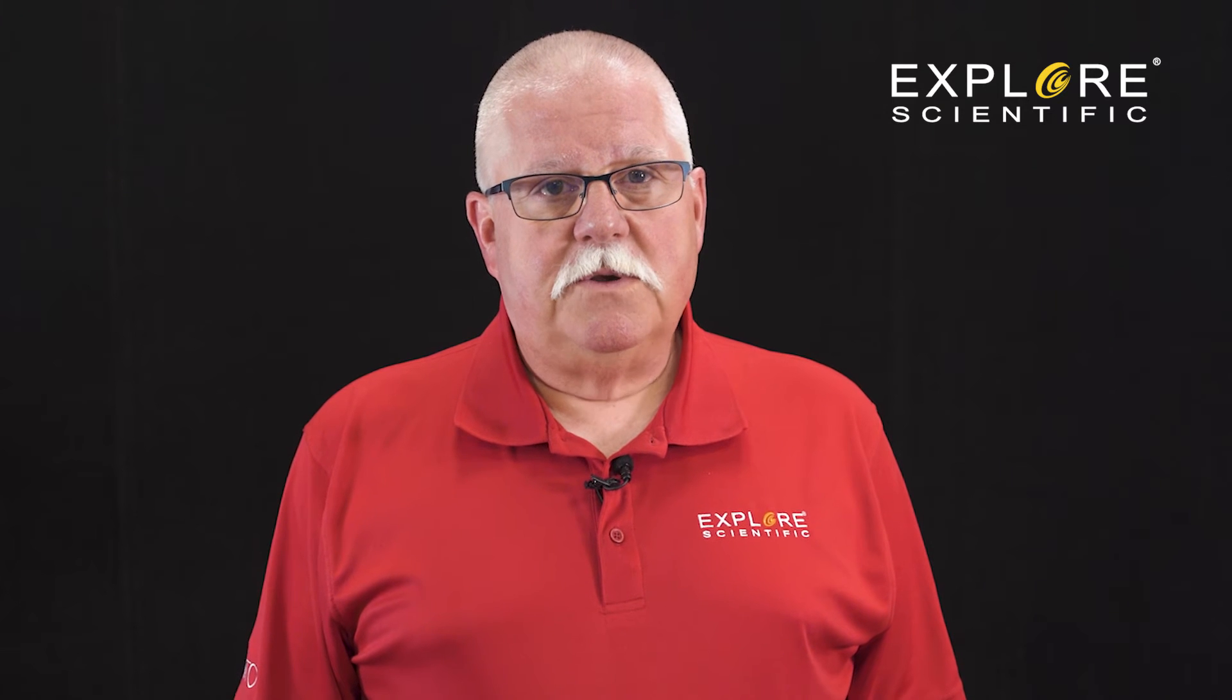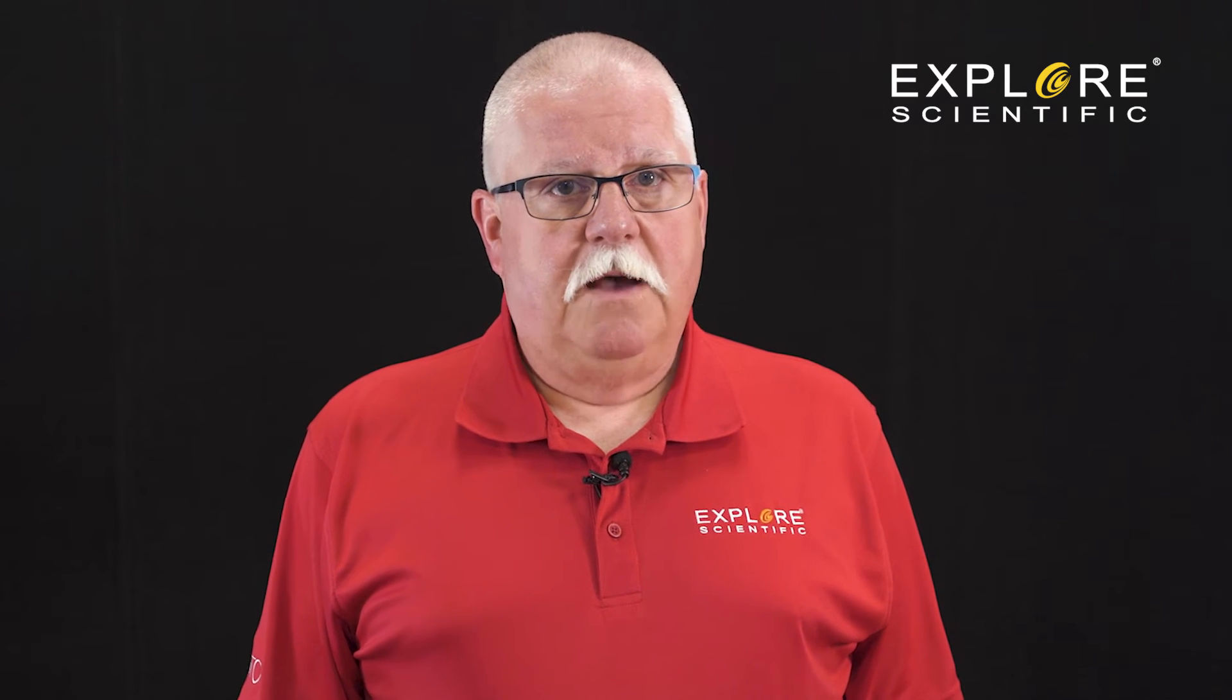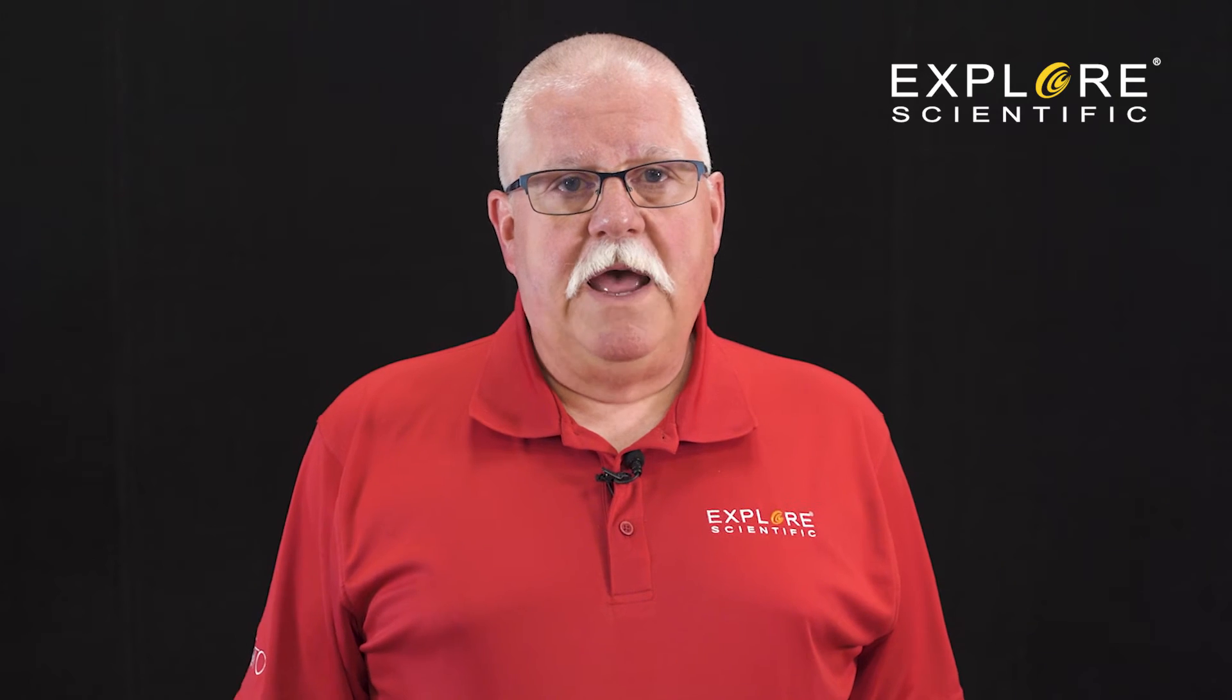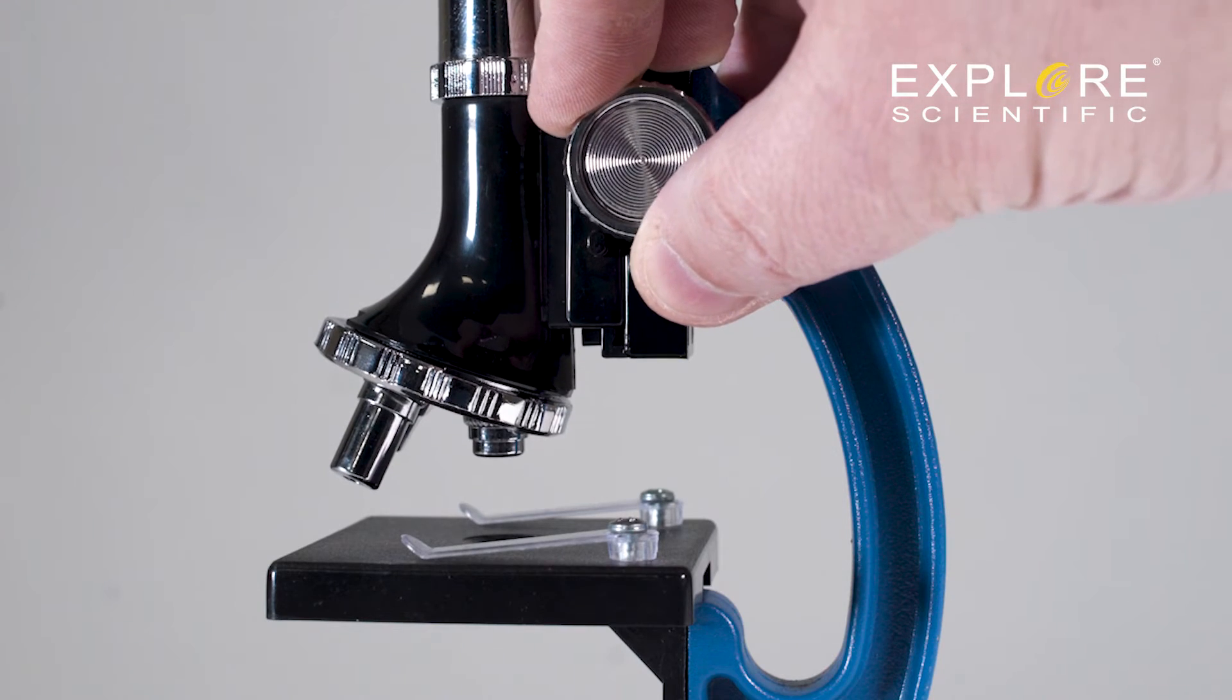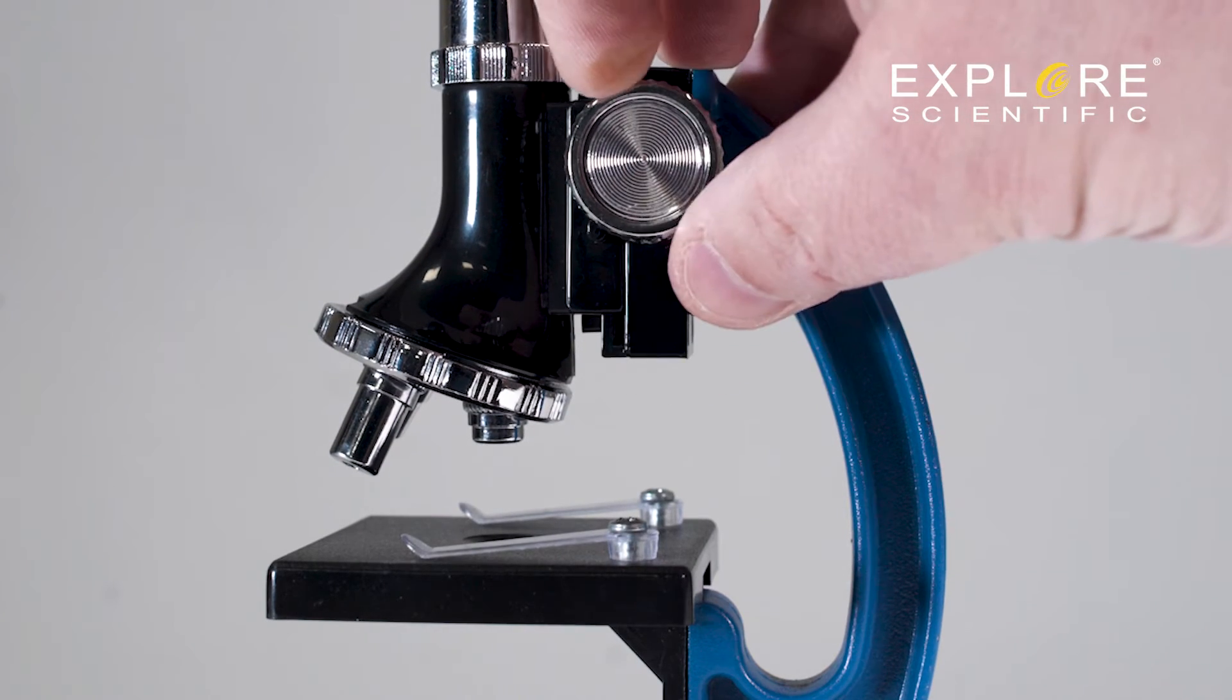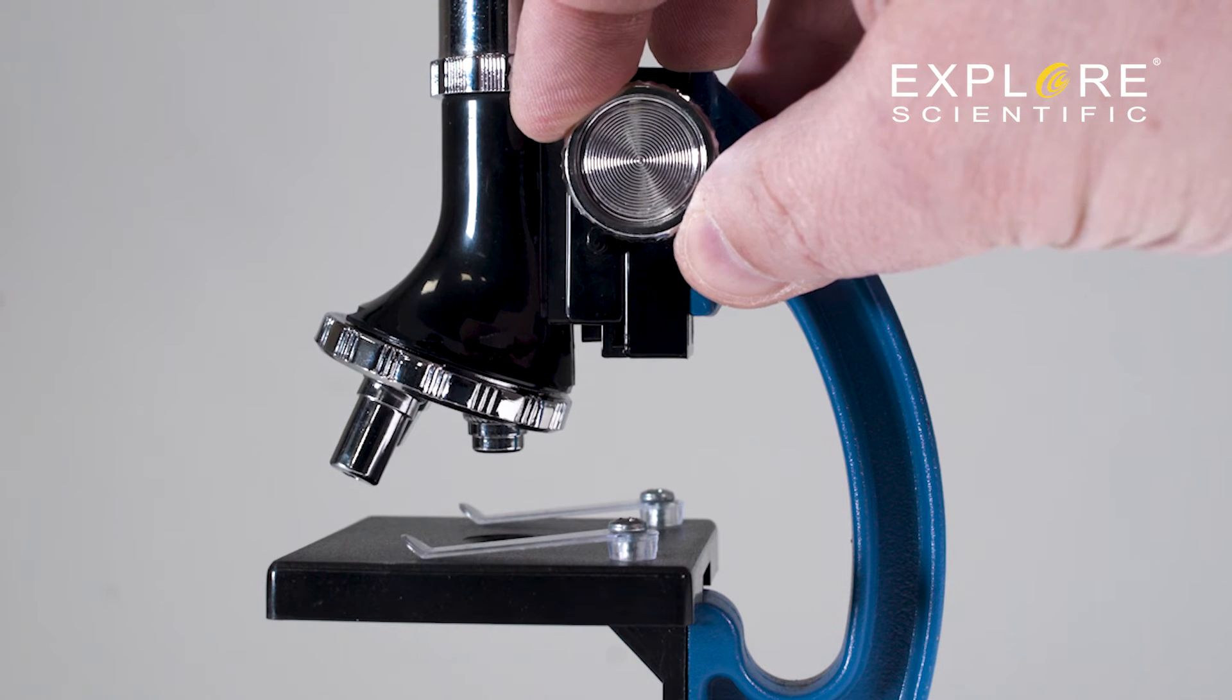Let's practice moving the focuser. Grasp the focusing knobs and rotate them, which makes the eyepiece move up and down. Practice turning the knobs very slowly. This is important because the specimen will be in focus for a very short period of time. It's easy to go right past the focus point and never notice it.